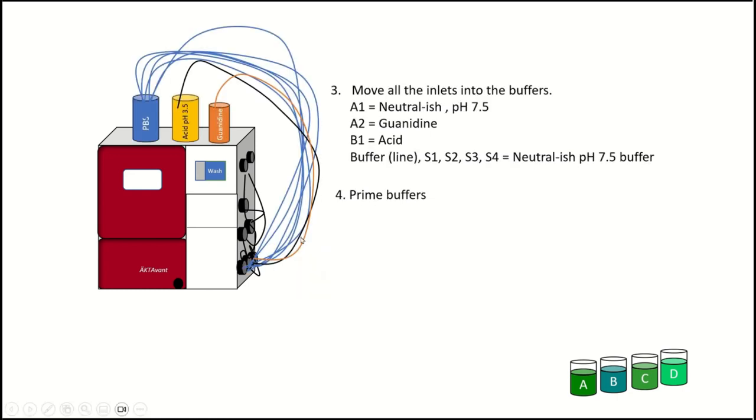After you do the water wash, then you're going to put everything into its respective buffers. So I was saying this is PBS right here, the neutral-ish running buffer. So you're going to have a lot of lines in there because A1 is going to be in that one, but also the sample pump buffer line and then S1 through 4. But then you're going to have one line in the acid elution buffer and then one in the guanidine hydrochloride. And then when you do that, you're going to use the pump wash instruction to prime all of the buffers again. So we've gone for each line, we've done water for each one and then buffer for each one.